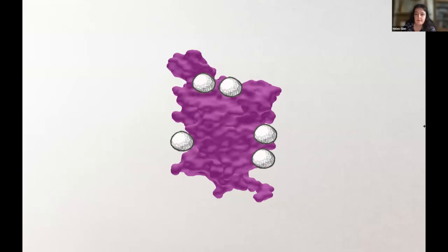Or you have a free set of structures where you've solved the structure, but you haven't included it in the data, kind of like an R-free set, and you can use that to evaluate a given solution. And the solutions are also able to be pulled out because you can cluster on the antibody positions using cluster4x. And so the combination of these two methods allowed us to pull out the true binding map for the antibodies.